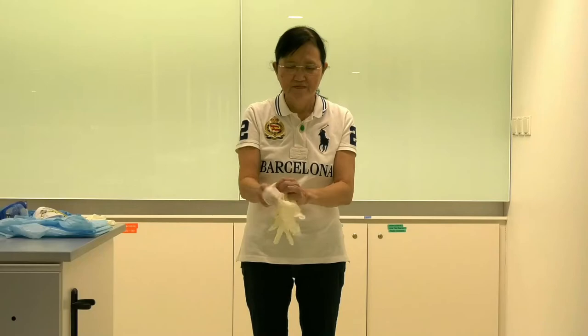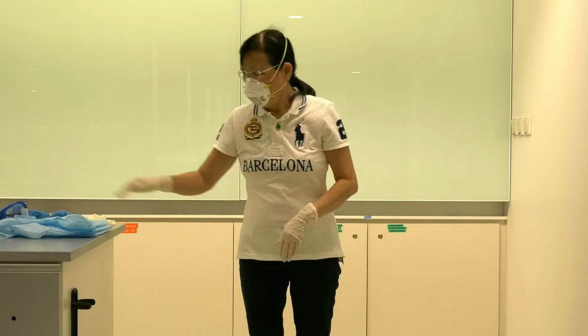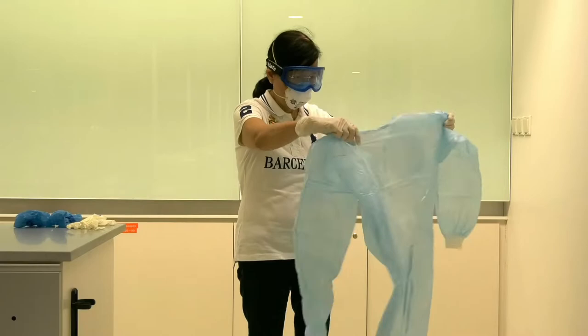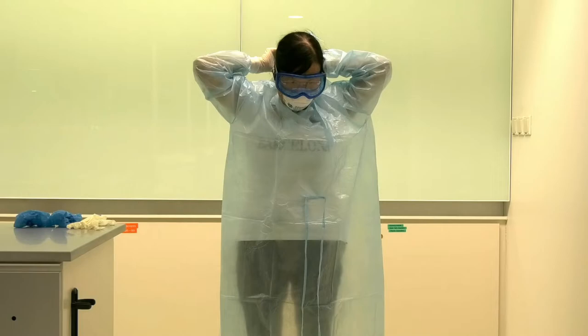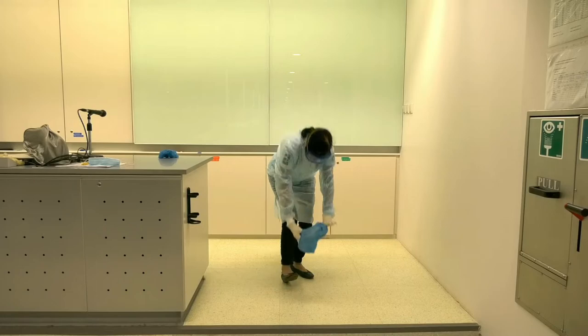Donning of PPE in sequence. Do a seal check to ensure a tight fit of the mask. Safety goggles. Disposable lab coat. Gloves outer layer. Shoe covers.